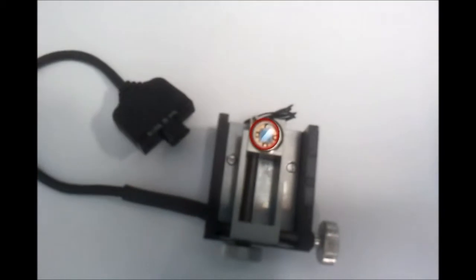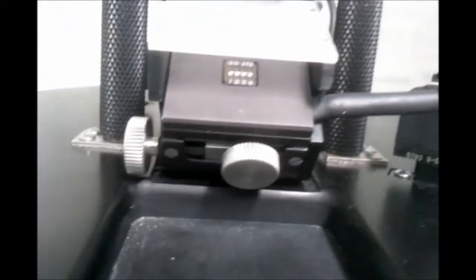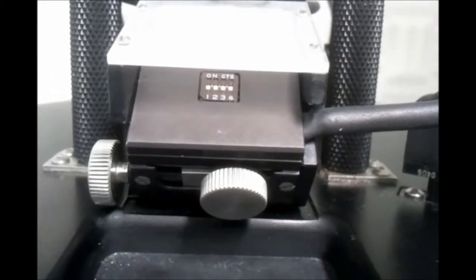This has 4 photodiodes which detect the laser light. When the laser is shone into a diode, it creates a current. As the light moves around, the current moves between sections, allowing you to measure how much the laser is reflecting from the cantilever and therefore how the cantilever itself is moving.